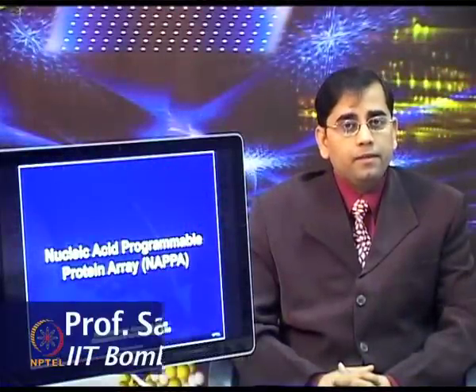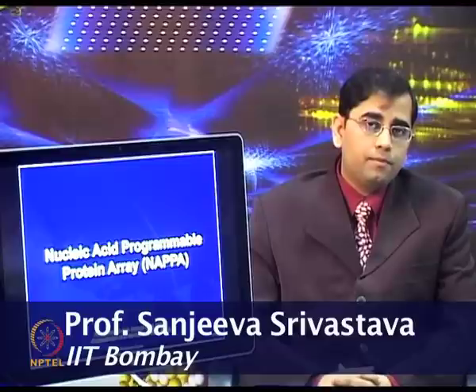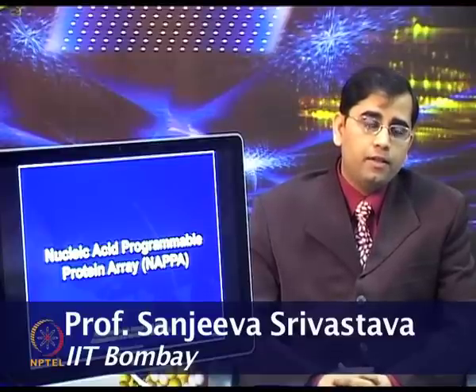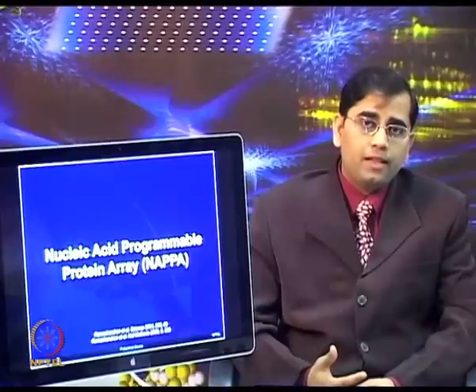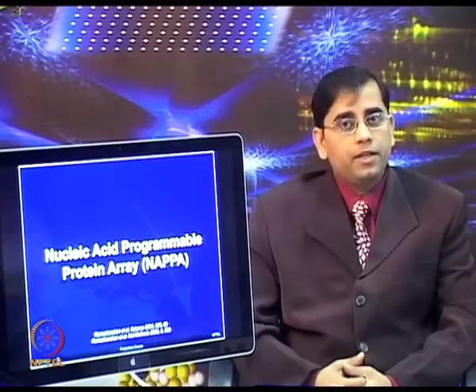The NAPPA technique minimized direct manipulation of proteins, and it has enabled the interactions to occur in the mammalian environment by using the proper promoter sequences and the cell-free expression system based on the rabbit reticulocyte lysate.